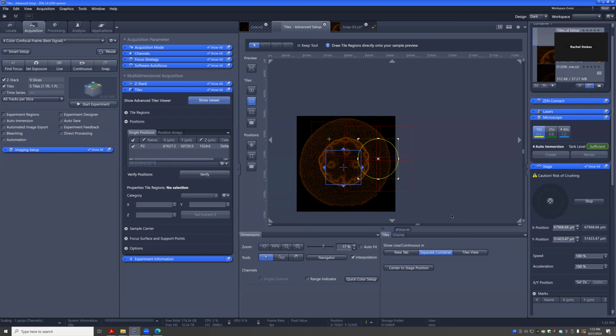But you can also see that it'll grab a lot of area that you're not as interested in. So here you can play a little bit with either the zoom or adjusting the tile area, depending on what you're trying to see, to maximize your sample versus area scan. Similar to when you're doing a single field of view and you're just playing with the zoom and adjusting the frame to what is scanned. So that's what you can do here.